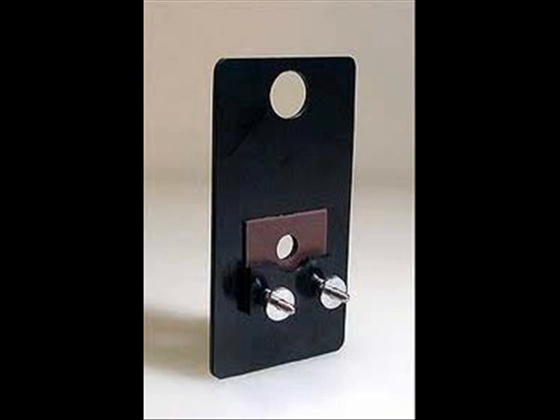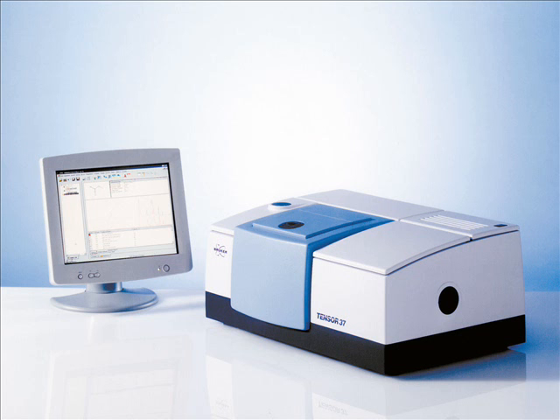The beam enters the sample compartment where it is transmitted through or reflected off the surface of the sample, depending on the type of analysis being accomplished. This is where specific frequencies of energy, which are uniquely characteristic of the sample, are absorbed. The beam then finally passes to the detector for final measurement.